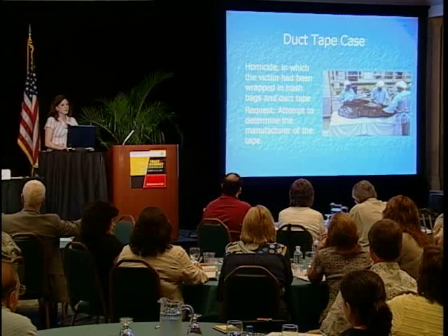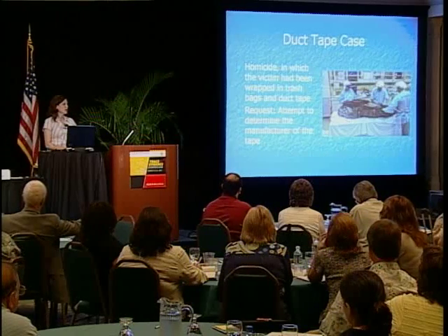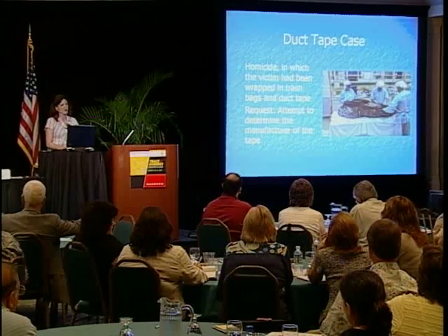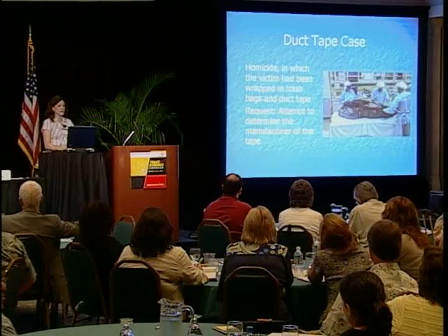So for the duct tape case, this was a homicide in which the victim had been wrapped in trash bags with duct tape around the trash bags. And we were asked to attempt to determine the manufacturer of the tape.